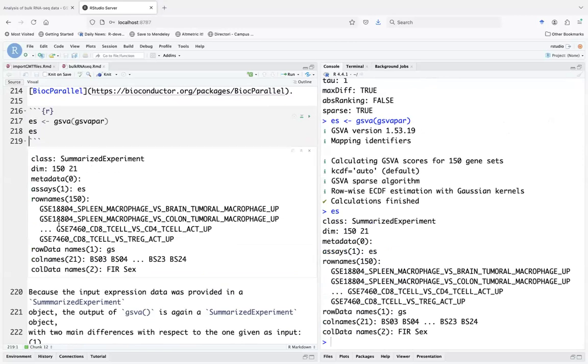Okay, my question was about the fact that the data was not normalized from the beginning. If the function works on ranking, is it really important? Do you need the data to be normalized, or can you work on raw data? You can try a log2 transformation maybe. I don't know if it was an example. You can try to give unnormalized data, but I think that it makes more sense to be normalized. It will give a higher percentage of false positives if you do not normalize.